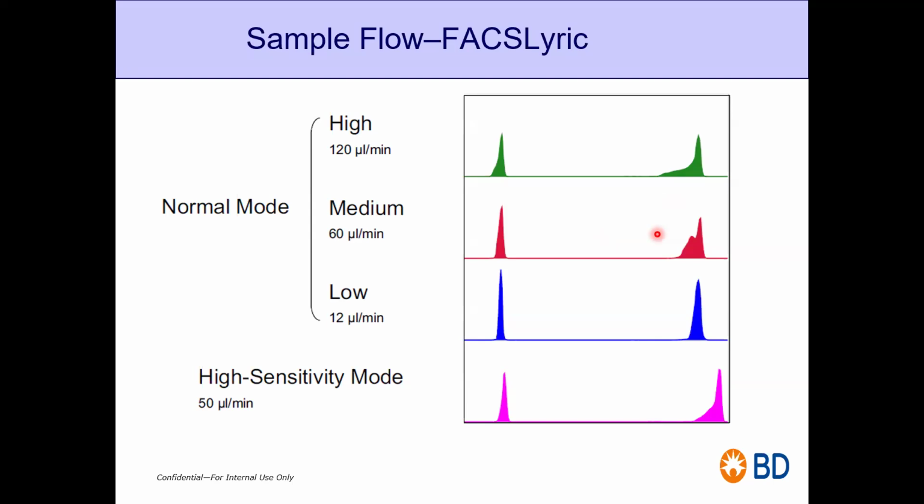But then the question comes, why do we need these three options? We could have just used the low sample pressure. Why are we going to high or medium? Let's take a case where you have a lot of cells. One of my colleagues has a favorite dialogue: if you want to finish your PhD in 5 years, you need high.